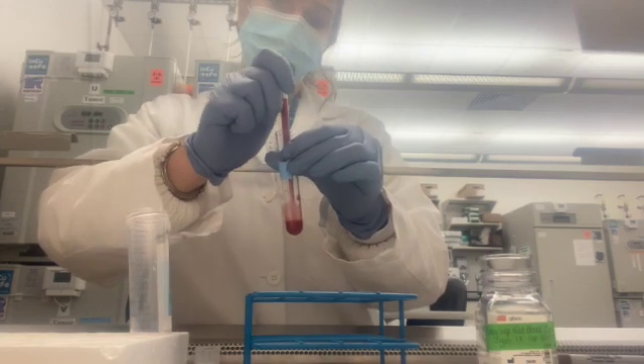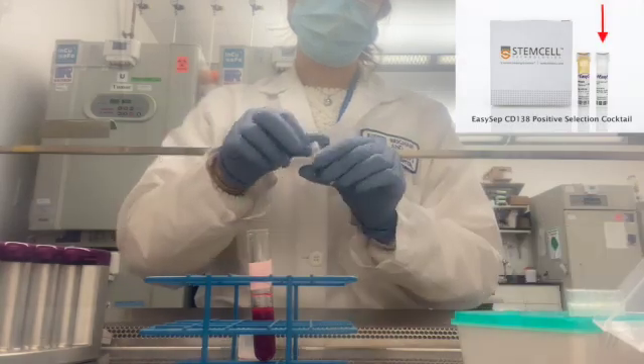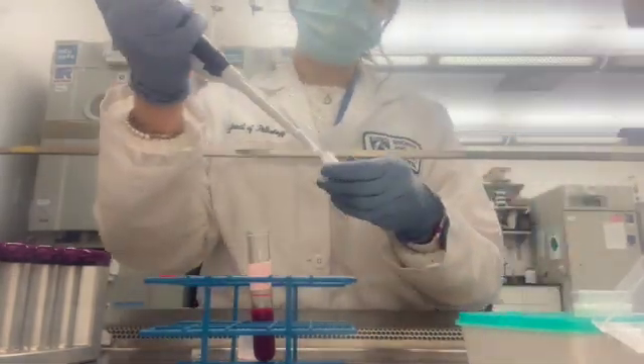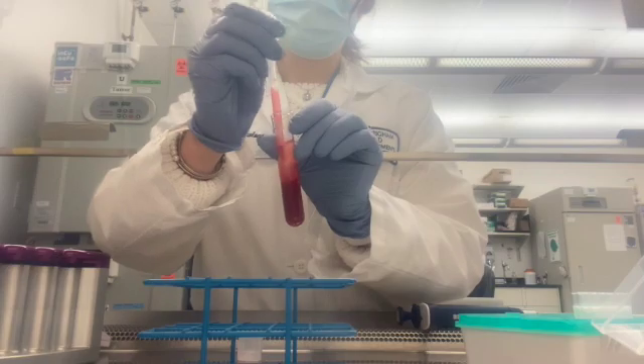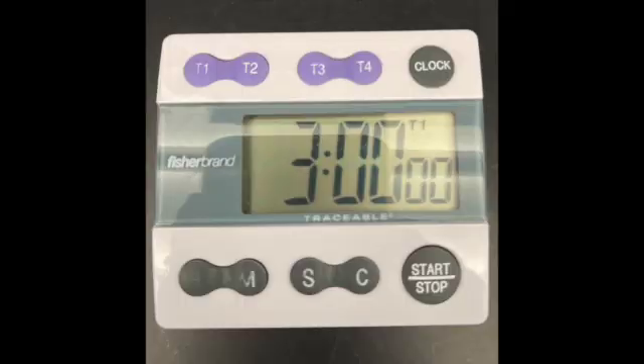Gently mix your sample up and down 2-3 times. Next, add the positive selection cocktail to the sample. This cocktail should be colorless. Set your pipette to the correct volume using the table. Add the cocktail and gently mix it up and down 2-3 times. You can cap your sample if you want to. Set a timer for 3 minutes.